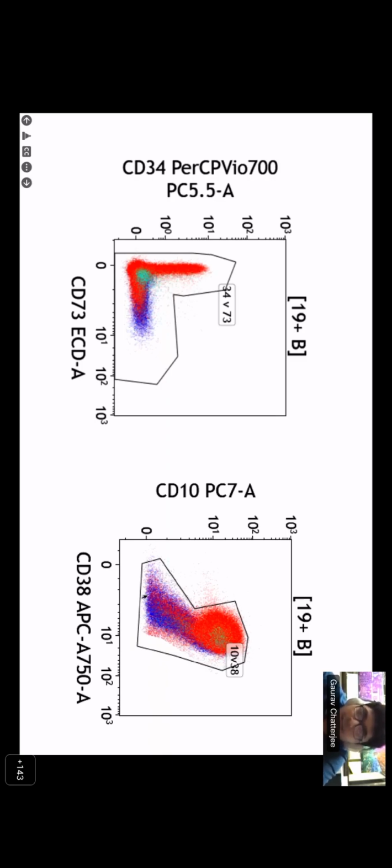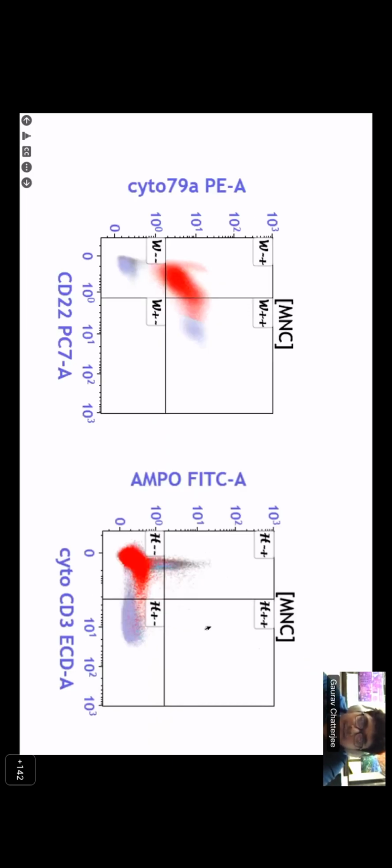In B lymphoid blasts, a very important anomaly that we see is CD10 positive and CD38 negative. So usually B lymphoid blasts can be somewhere here. But in this case, the CD10 and CD38 pattern is mirroring what is seen in normal. Now, these are some lineage, some cytoplasmic markers. We did MPO, which is a myeloid lineage marker, which is negative. Cytoplasmic CD3, a T lineage marker, was also negative. And some B markers like CD79a and CD22 were positive, right?